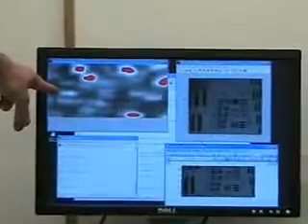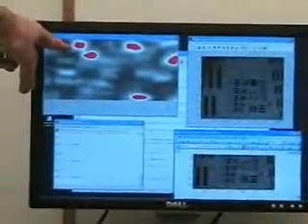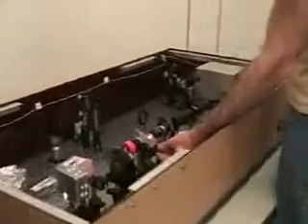And as I do that, I'm getting more. Now see, I've started to pick up a little bit of saturation. You can also tell that I'm out of focus, so I'm not worrying too much about the saturation right now. What I'm going to do is focus using the same knob, and this is just a paper sample. It's a little hard to tell if I'm well focused, but notice that there's also more red. When you get into better focus, you're often collecting more light, so things will look brighter. So I'm going to adjust, oops, wrong way. Here we go, I've got a good grayscale. So I'm going to adjust my focus here till I can see the fibers.